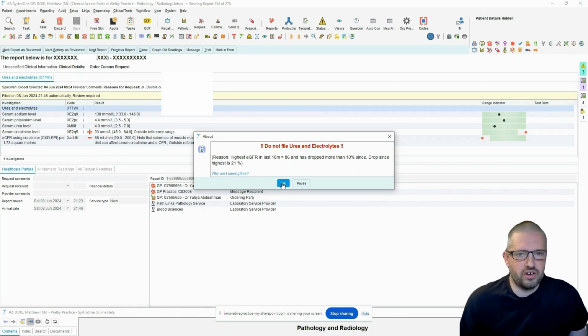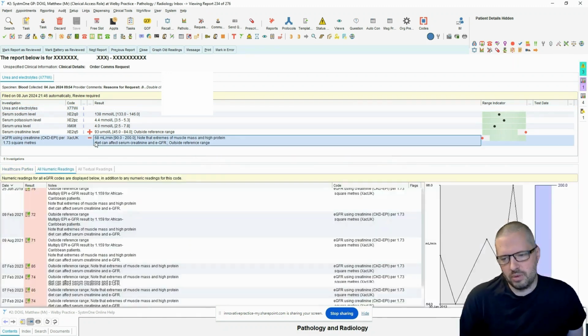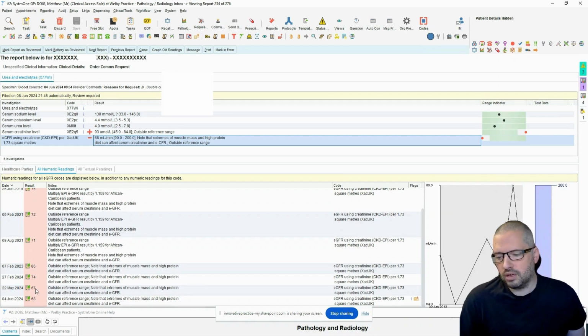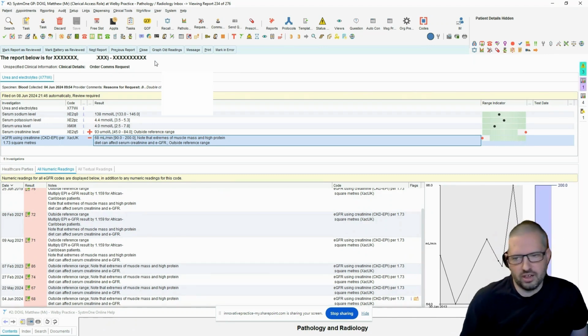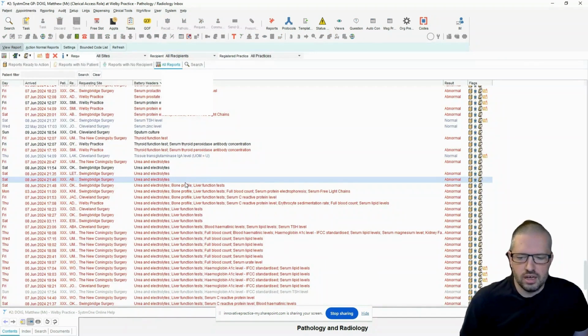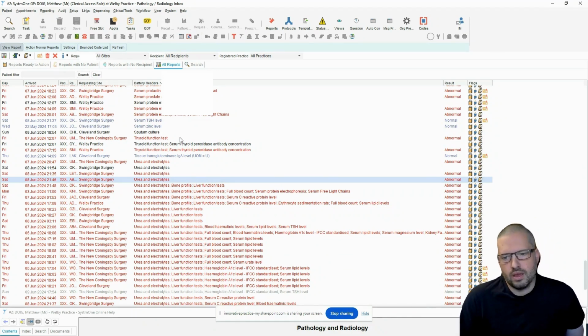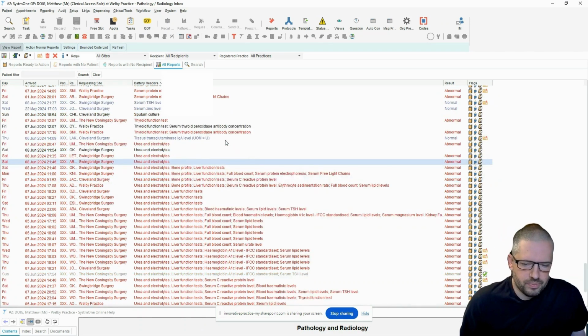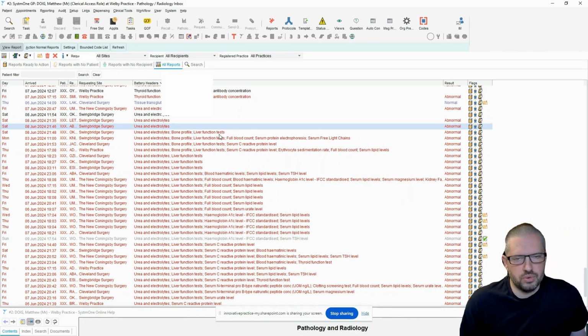Now, if you're a clinician, that doesn't necessarily mean we're expecting you to do lots of things with it, but it may be. In fact, looking at it, you can see it's a pretty big drop since about a year ago. So I'm not a clinician, I'm not going to file that, I'm not going to touch that, and so we leave them there. Some practices prefer to work differently and say, let's task those instead. We can configure the system to work like that for you if you'd like. But generally, we found this approach works best.